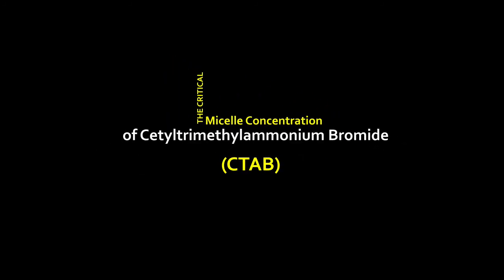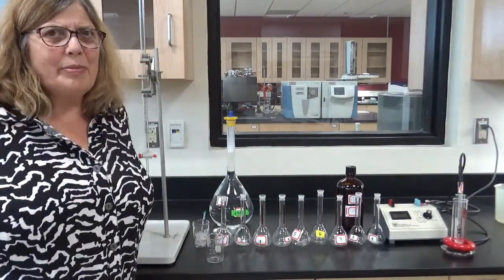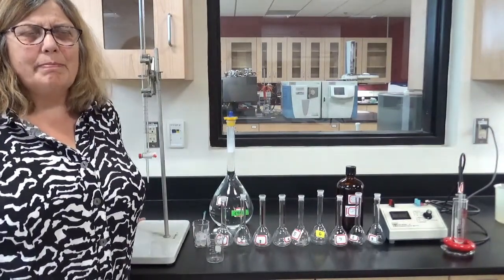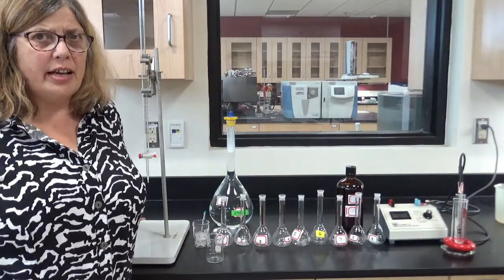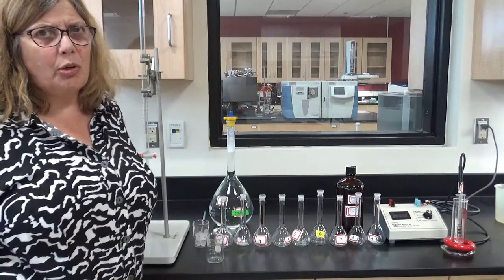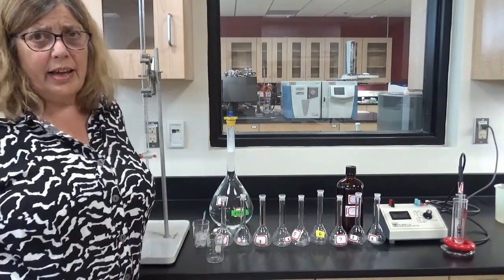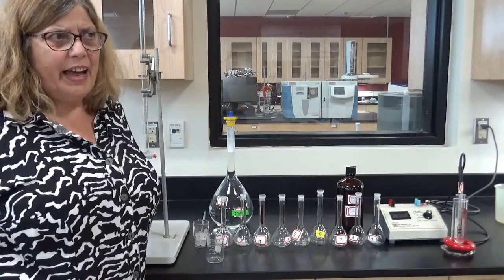This lab is on the critical micelle concentration of cetyltrimethylammonium bromide, otherwise known as CTAB. Hi everybody. So this time I'm going to talk about the lab that we call the critical micelle concentration of cetyltrimethylammonium bromide, or CTAB. Okay, so CTAB is what we call a surfactant.